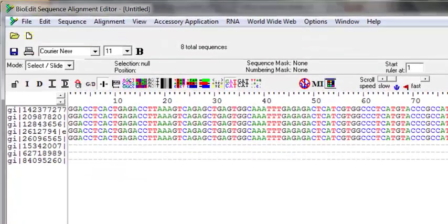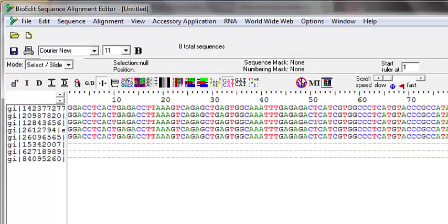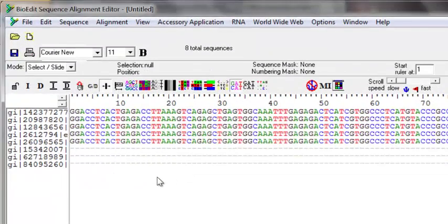In this video I'm going to talk about some options in BioEdit which are very useful for the editing sequence. During the editing process you might want to manipulate the sequences by adding some extra bases, deleting, or you want to drag the sequences around on the screen. What I have is a set of aligned sequences which I downloaded from NCBI.